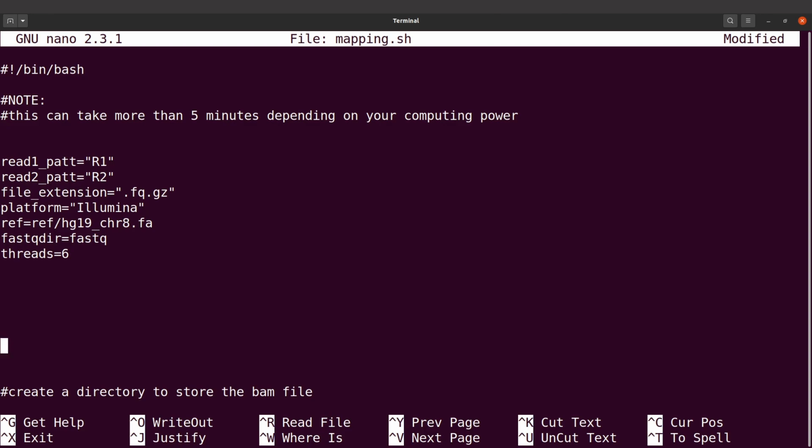So let's save the changes and then exit. So let me just take you to the other script which has the one for the single sample. I think we have to look at that also before we proceed, for those who just joined or those who are watching the video for the first time.